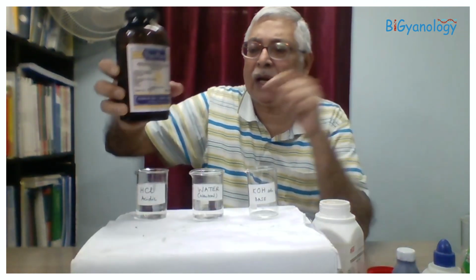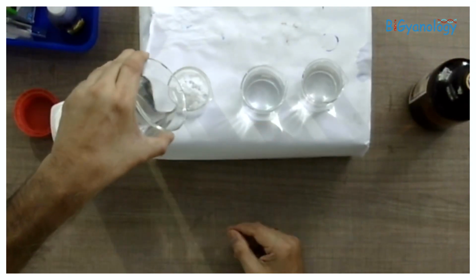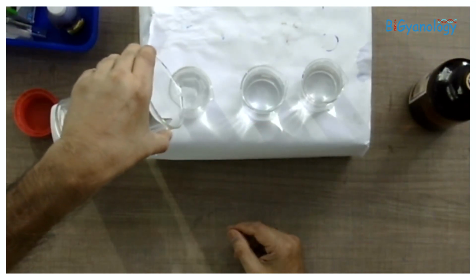This experiment is so simple to do but very complicated to understand. To make you understand, I am performing a simple experiment. Here is some HCl which I have diluted and kept here. Here is some potassium hydroxide. I'm mixing with water to make it a solution.